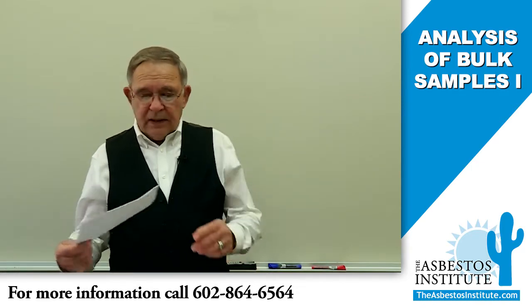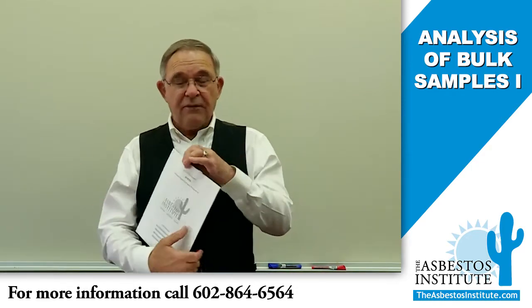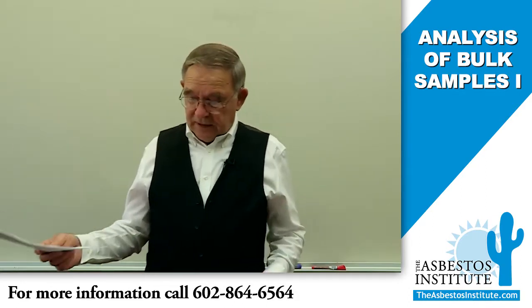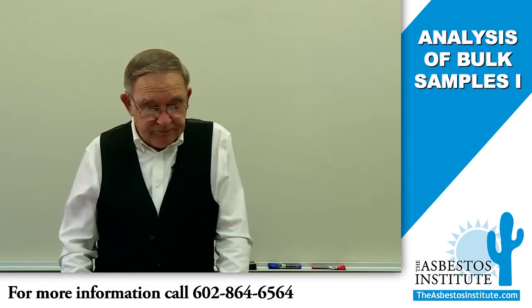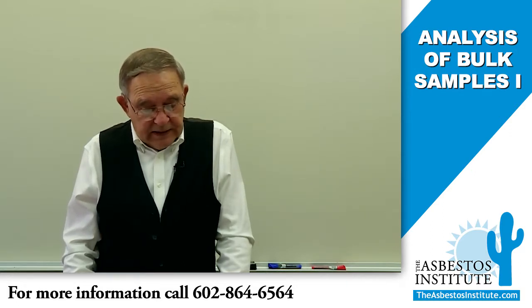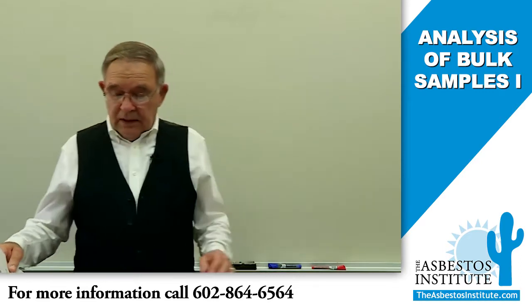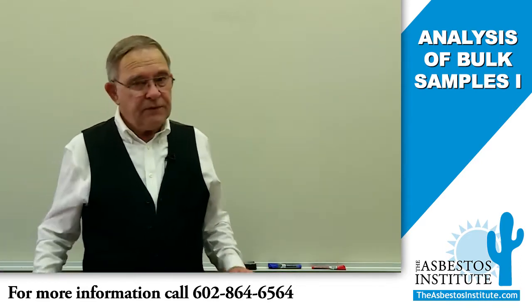In this regulation, AHERA, if you have a copy, you might want to reference that and follow along with some of the things I'm going to talk about here. But I want to focus on bulk sampling and analysis, mainly the analysis end of that. A few general comments first.